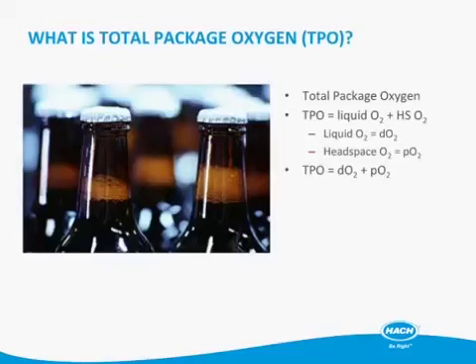So what we want to do is look at the total O2 in the package, because ultimately all that oxygen is going to react with the beer. And if you give that beer enough time, in some cases of some types of packages it's only days, there will be no O2 left in that package. So it's really important to look at the total package oxygen content of a beer.